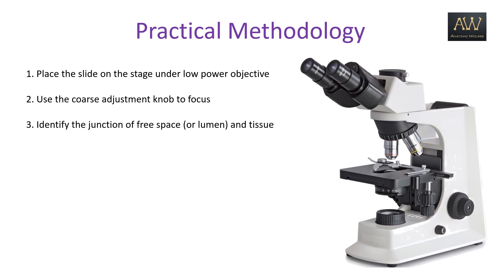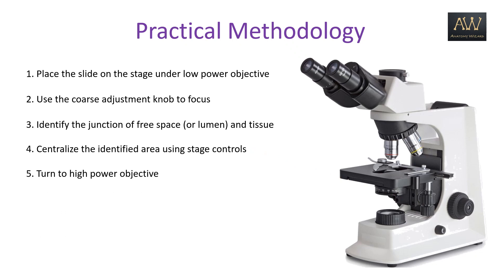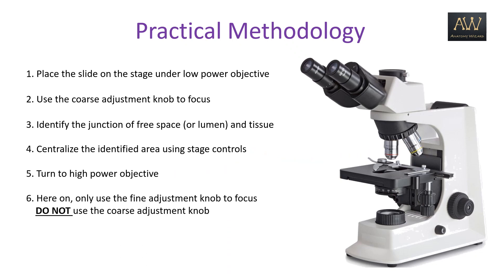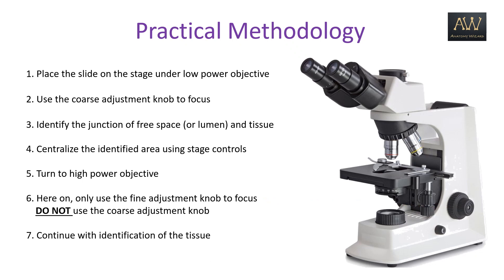Identify the junction of the free space or the lumen and the tissue. Then centralize the identified area using stage controls. After that, turn to the high power objective. From here on, only use the fine adjustment knob to focus. Do not use the coarse adjustment knob or else you will end up breaking the slide. Finally, continue with the identification of the tissue.